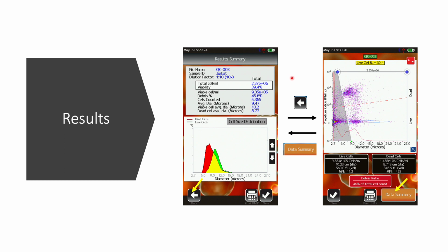Note that the higher concentration of the propidium iodide will show you the population here in the scatter plot, the population of the dead cells, as they have absorbed the propidium iodide. Also note, once again, that the living cells shown in this population down here will have a bigger diameter than the population of dead cells. We will be using the Moxi V later in lab.